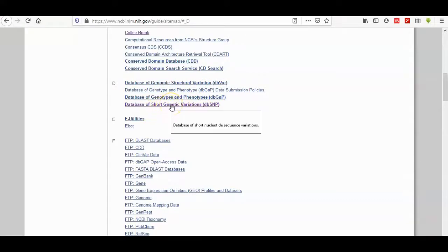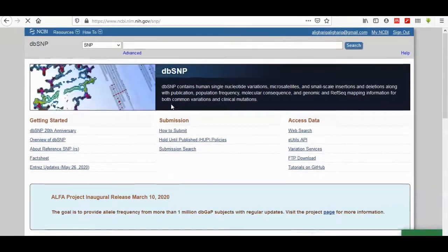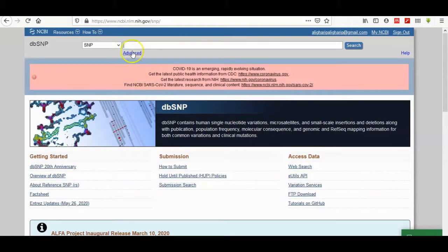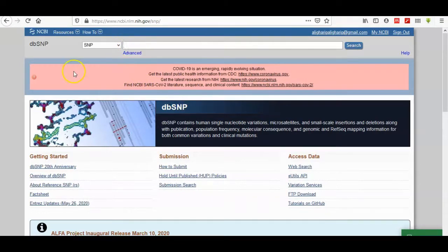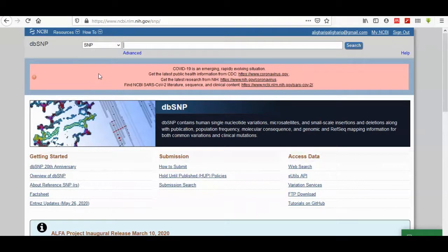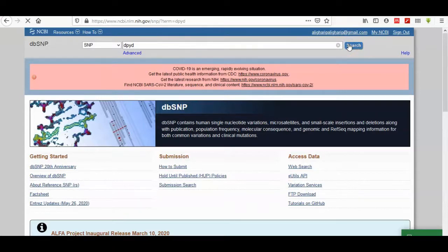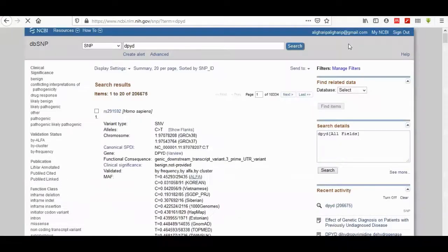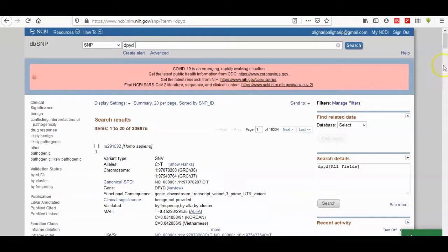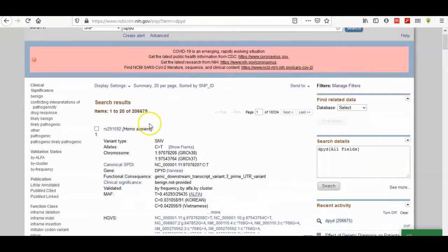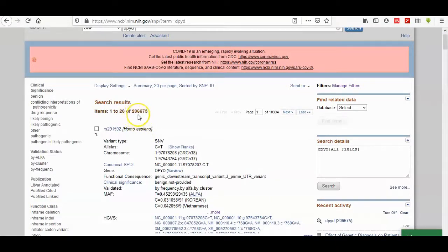I want to search for gene insulin or gene of DPYD. Here is a list of SNPs that can be available in that DPYD gene. There are a lot and it consists of a huge number of SNPs.